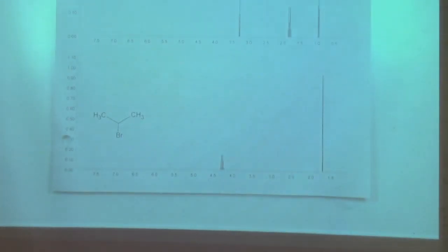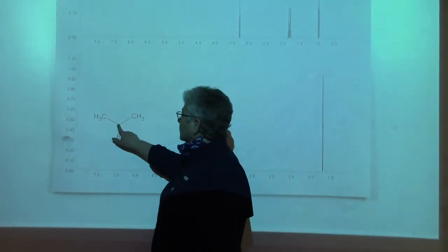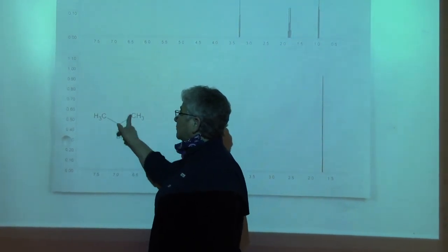Now you look at the last one. We have 1 hydrogen here, but in this case, these 2 methyl groups are the same.